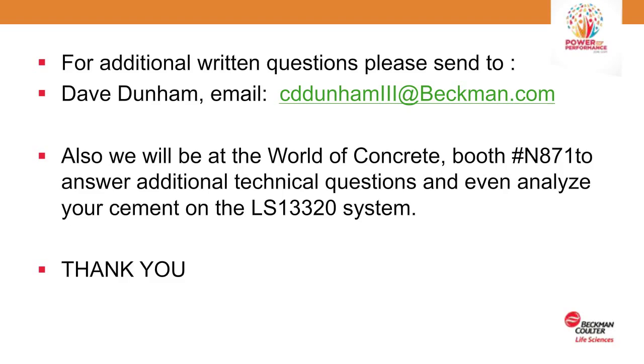You can fill up these little cups. You get 10 cups with the instrument, and you can just constantly feed, and the data is automatically being saved, so it's almost as fast as you can feed samples to it and tell it to operate. So it's not difficult to do a very high number in an 8-hour day. You're probably talking about a max of 30 to 40, 45 samples an hour.